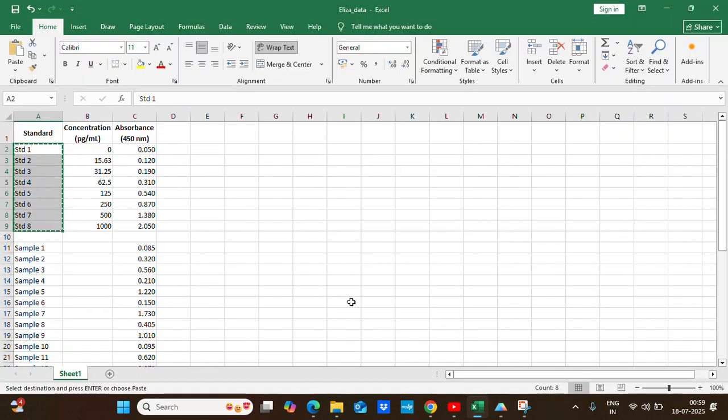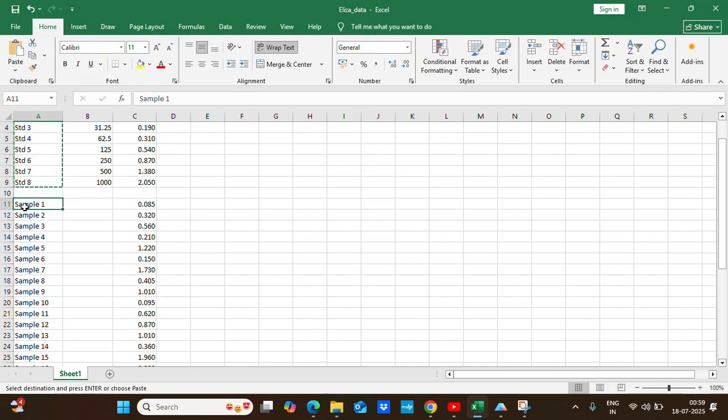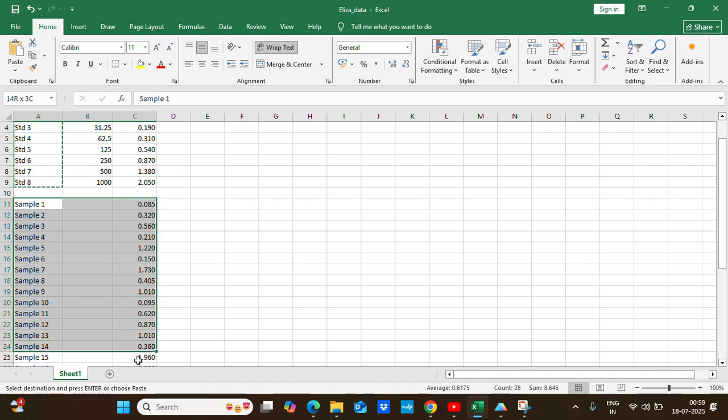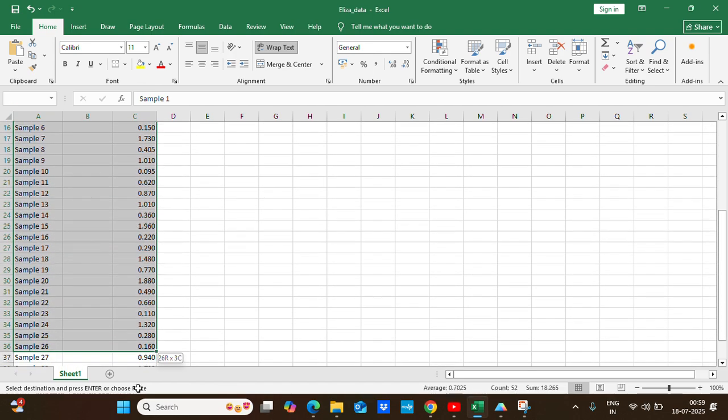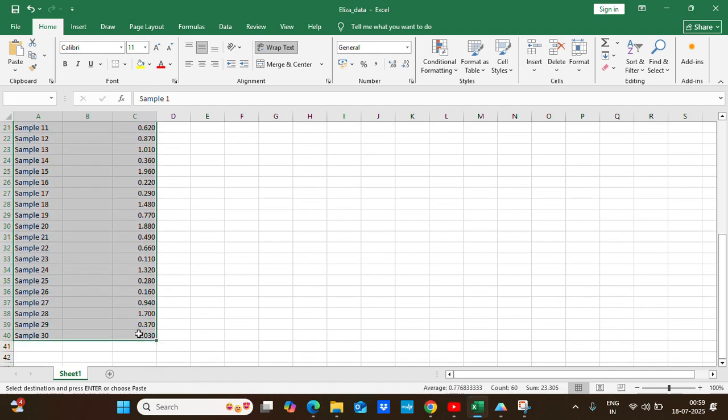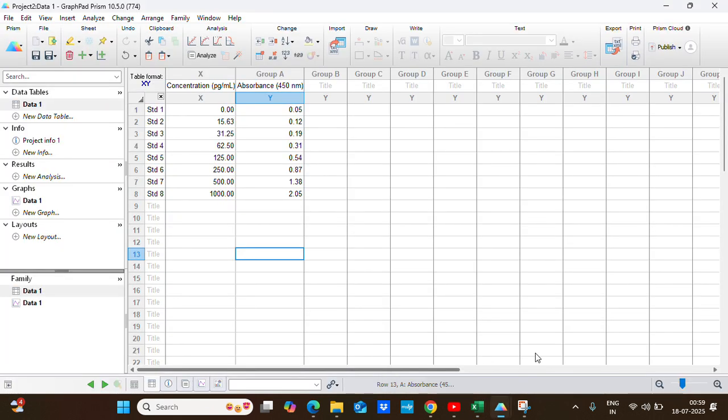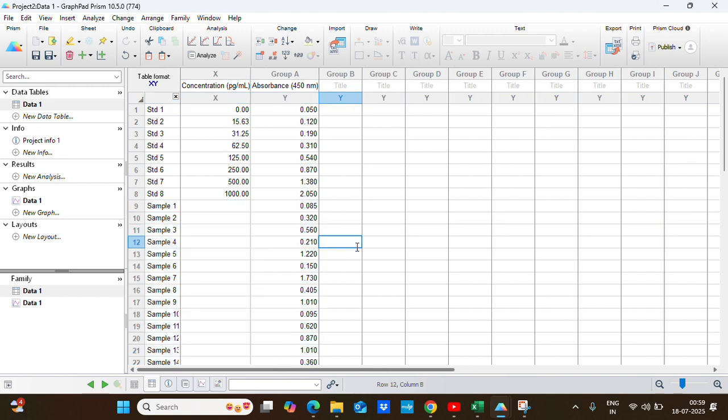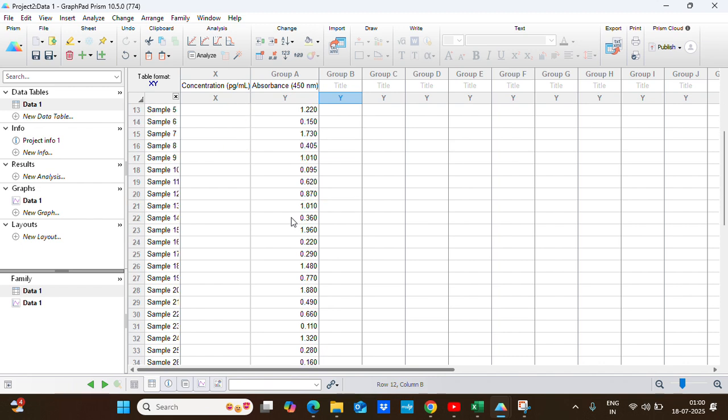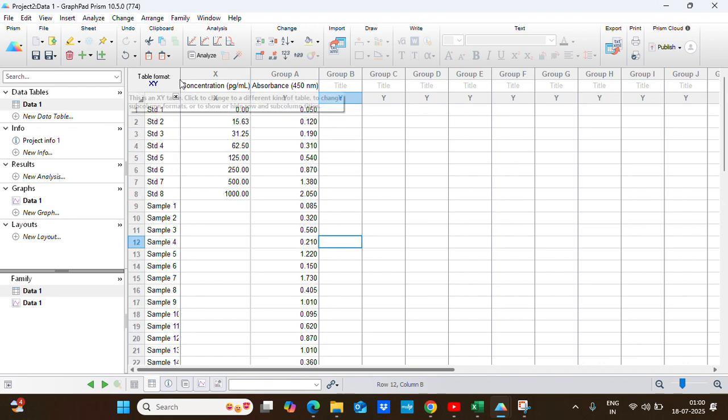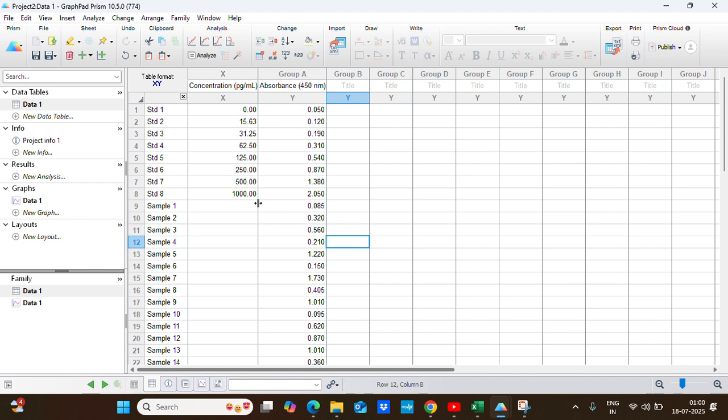Now let's copy paste the sample data. Here in the column of concentration for the sample data, we will keep it as blank. What GraphPad Prism will do is according to our model, it will find the corresponding concentration based on its absorbance value. So now we have all the data: the set of standard data and the samples which we have to find their concentration.